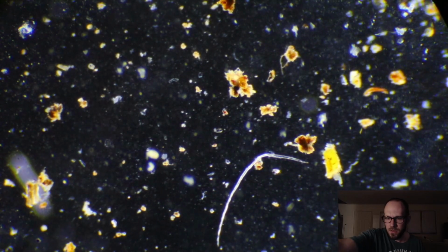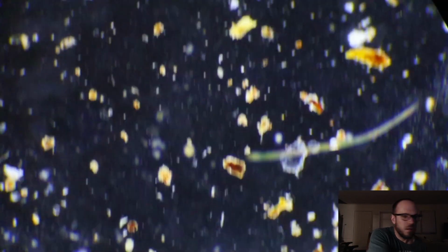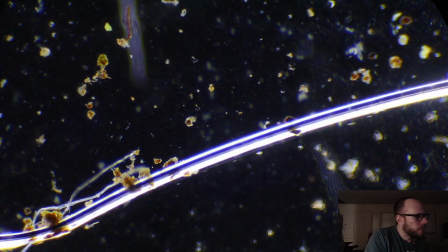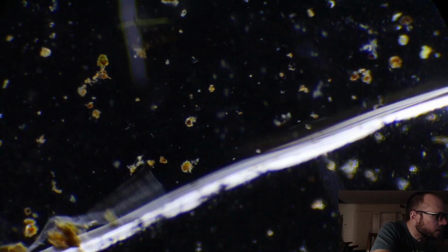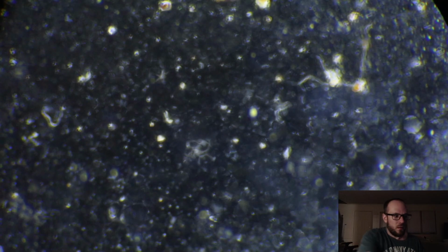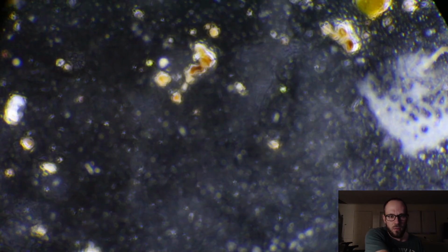Let's see. All right, so here we go. We've got dirt. I need to sanitize my hands. Now, I know there's water on this slide. It doesn't really look like it, though. Which side is the wet side and which side is the dry side? Okay, yes, there's definitely water. I just moved this stuff out of it, and you guys just saw it happen. Cool. Something green? No. Yeah, I guess there was stuff living on this slide, but there ain't no more.